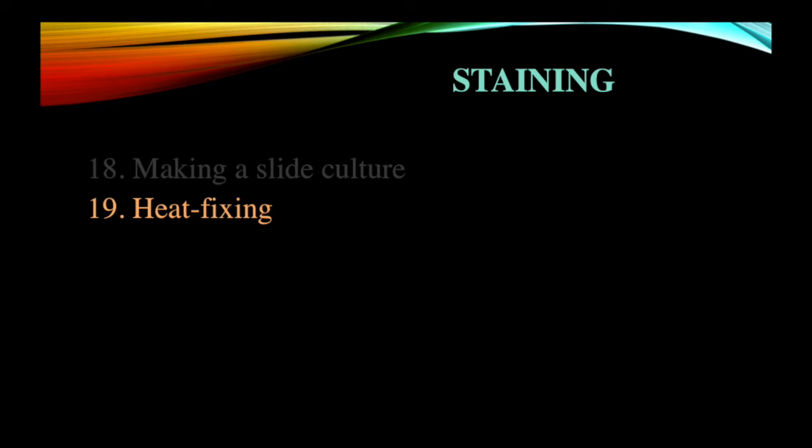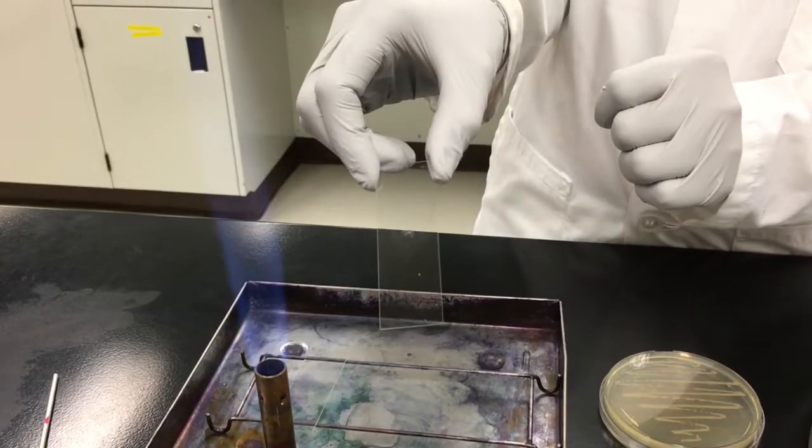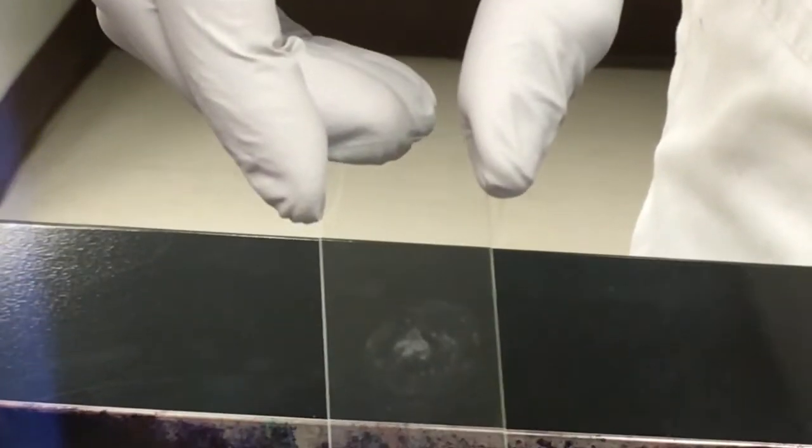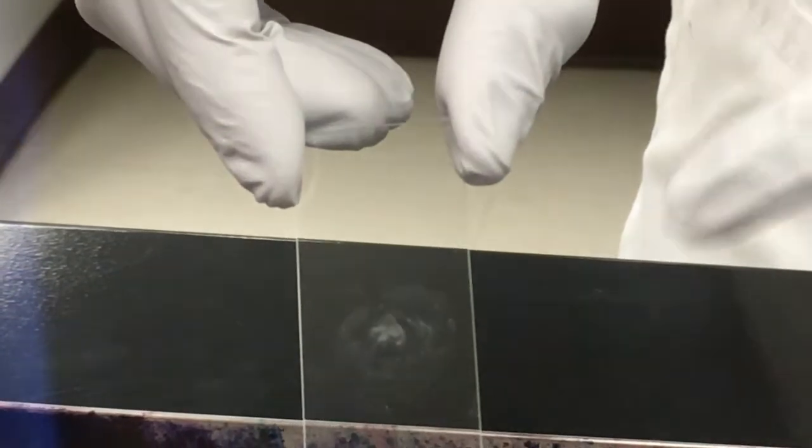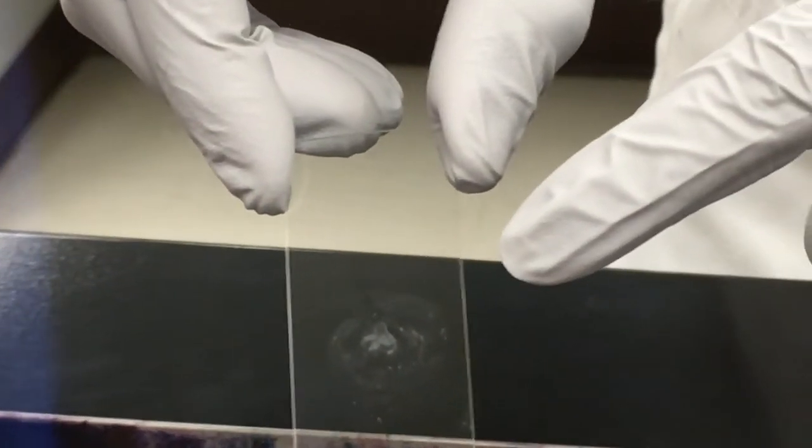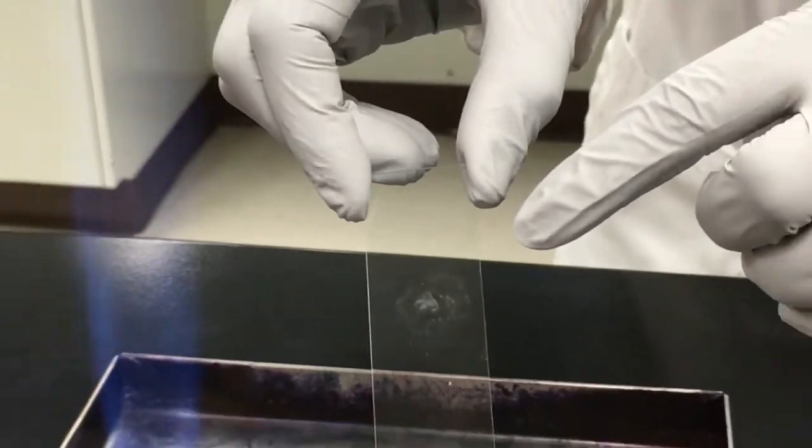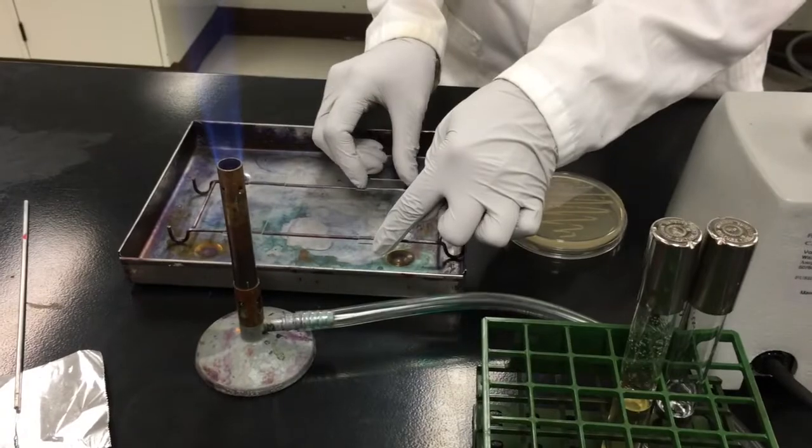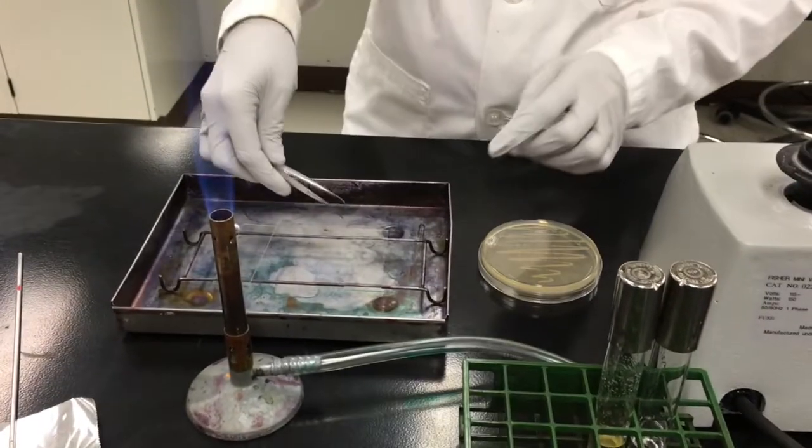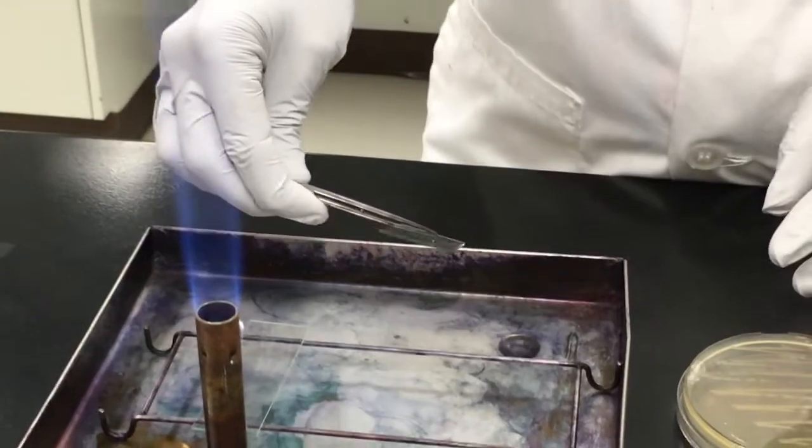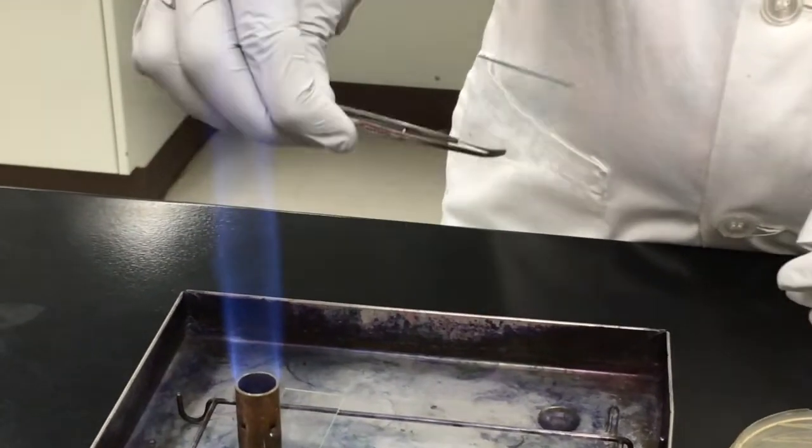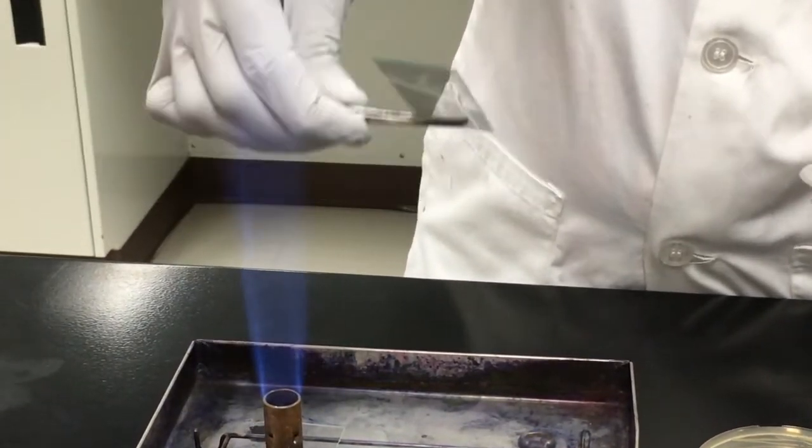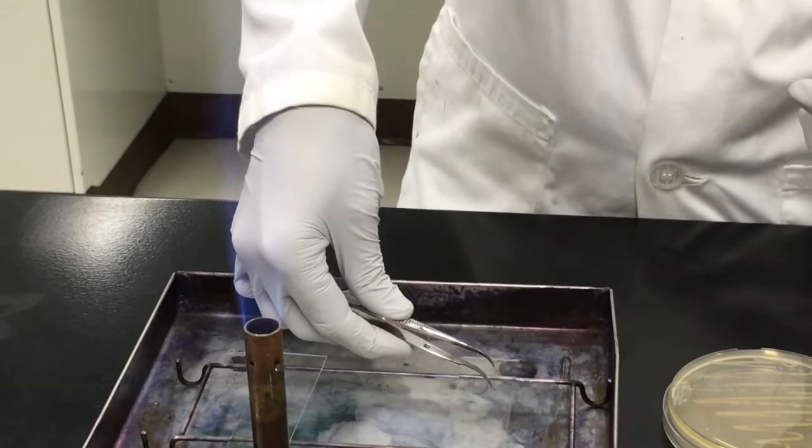Heat fixing is a process required by many staining procedures. We take our slide culture that we had prepared earlier and once it is completely air dried, it is now considered our bacterial smear. In order to be stained, it first has to be adhered to the slide and we achieve this by heat fixing. We will place the glass slide back into our staining tray and grip it with the tweezers so we do not burn our fingers during this process. Grip the glass slide carefully with the tweezers and pass through the flame quickly 3-4 times. The bacteria have essentially now melted to the glass slide and will not be washed off during the staining procedure.